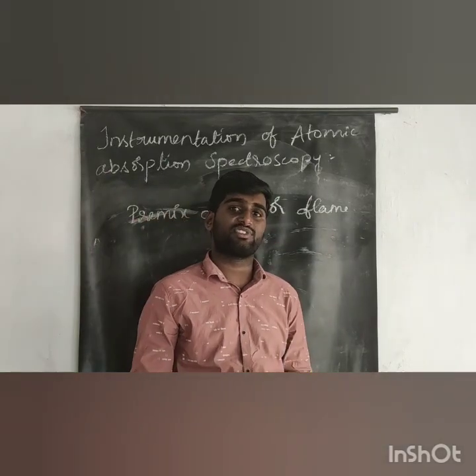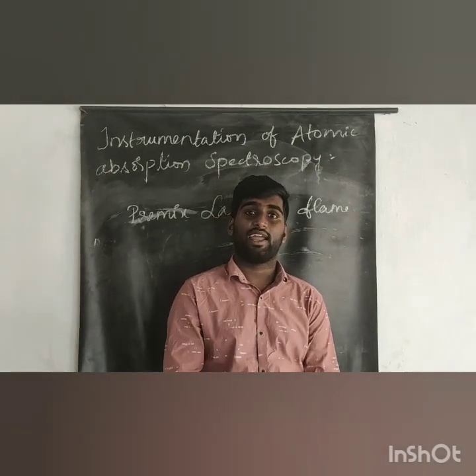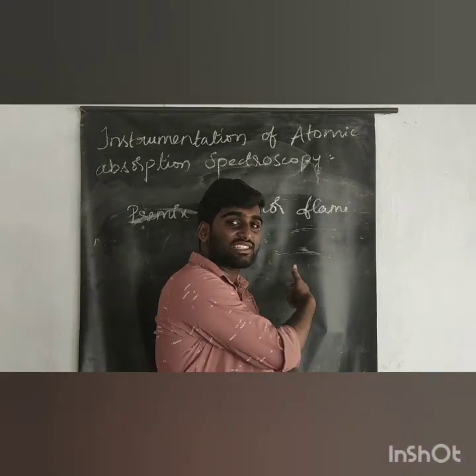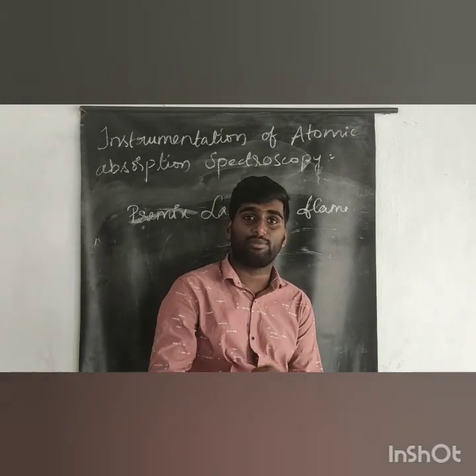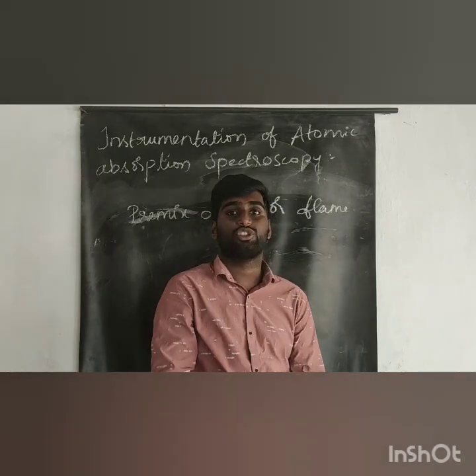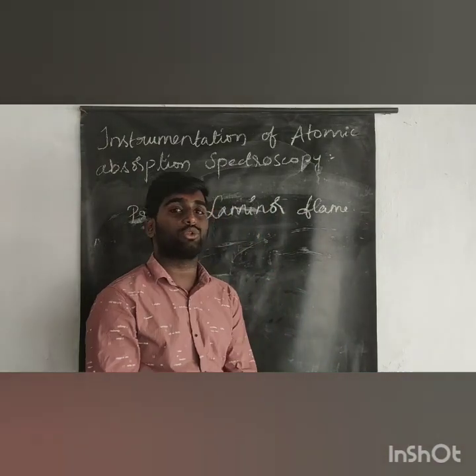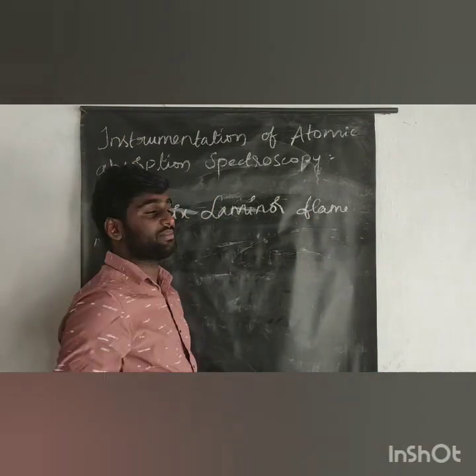In the total consumption burner, the flame is turbulent, and it has noise, and it has high temperature, and it controls the fuel and oxygen. But here in the premix laminar flame, the gases are moving non-turbulent. These are noiseless. The gases move in laminar flow. That is why it is called the premix laminar flame. The gases go in non-turbulent, laminar flow, and there is no noise. So that is why we call it premix laminar flow.